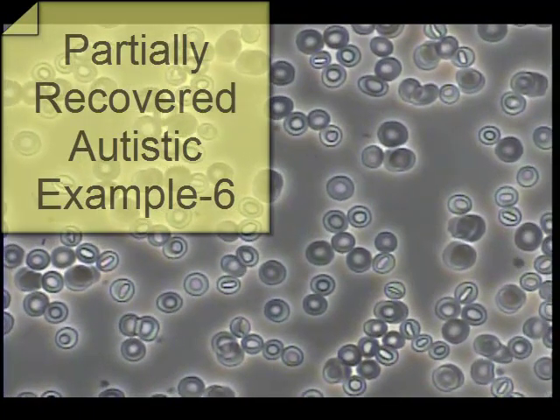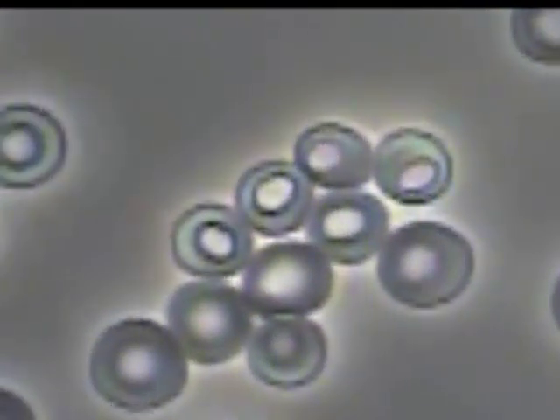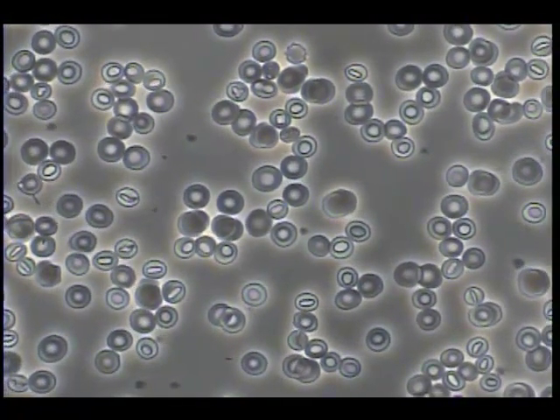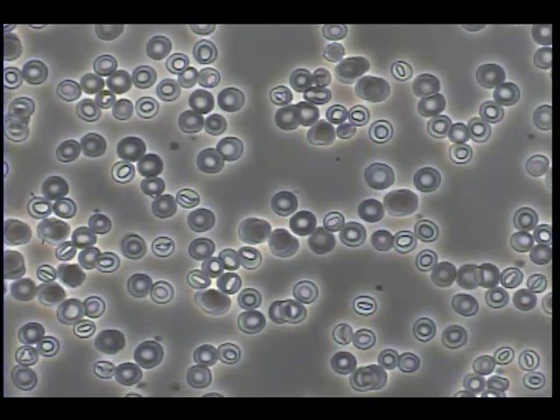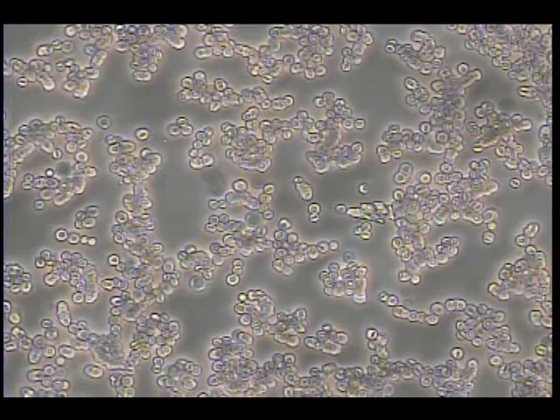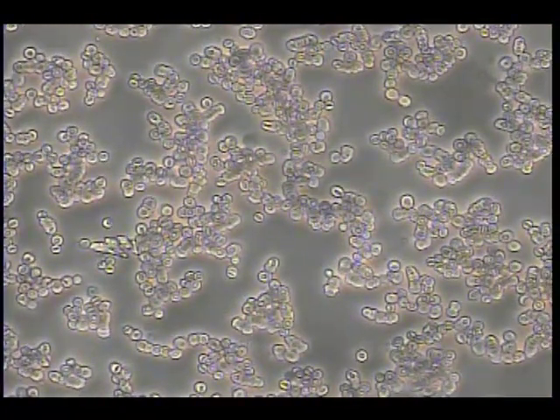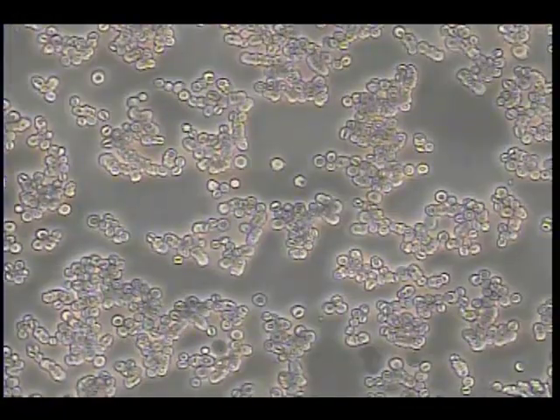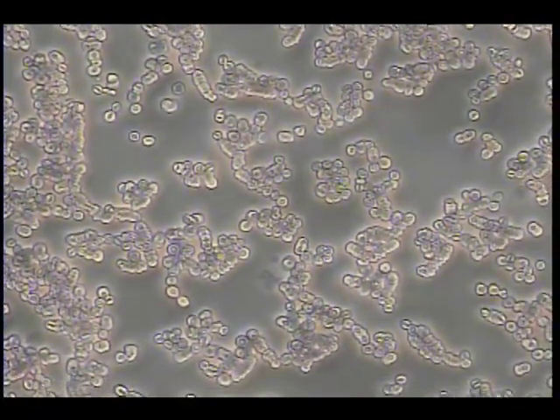This sample shows a much higher percentage of healthy erythrocytes. However, notice the very high percentage of donut-looking cells suggesting collapsed membrane. This blood, even though it's the most healthy of the sample set, is likely compromised in its ability to deliver oxygen to tissues. Observe that the high-level view of the cells in sample 6 is consistent with the close-up, as well as the tendency for donut-shaped cells that have collapsed membranes.